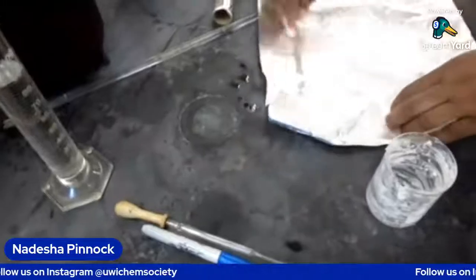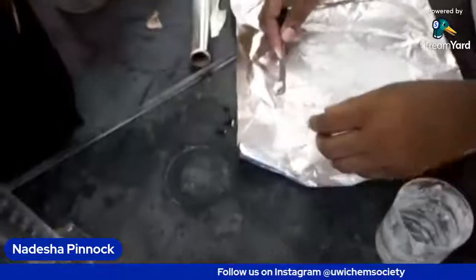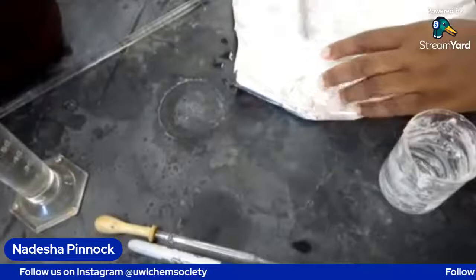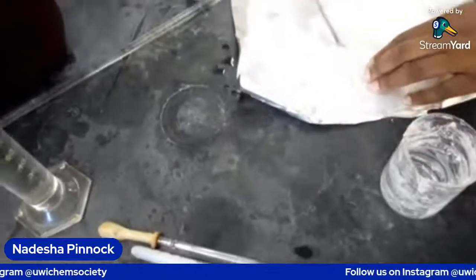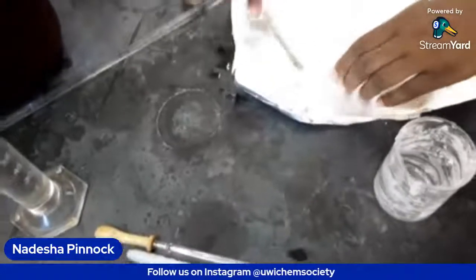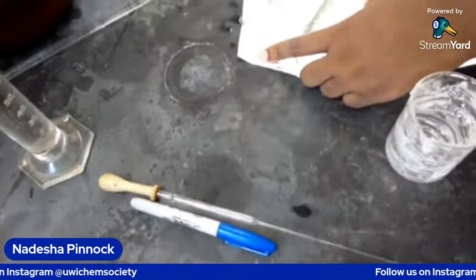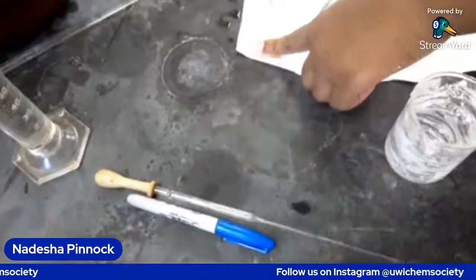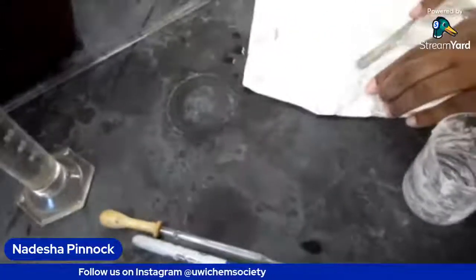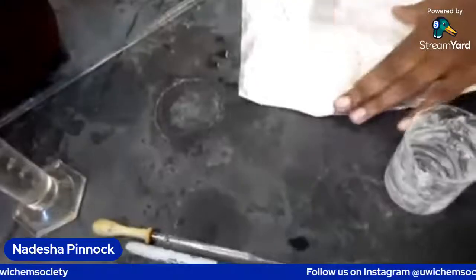All right, ready. This one is thicker, even without spreading. So we spread it, guys, to just make it cool faster. I mean, common knowledge: if you spread it out, it cools faster instead of leaving it in one clump, and also to give it its form when it's cool. That's enough for the night.